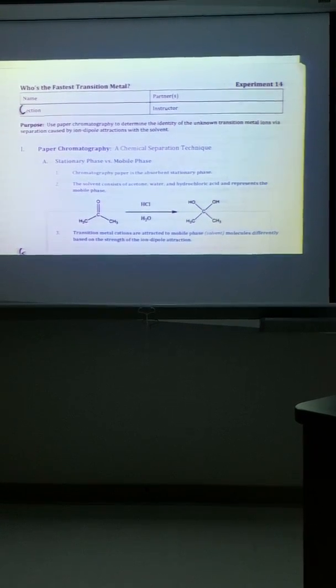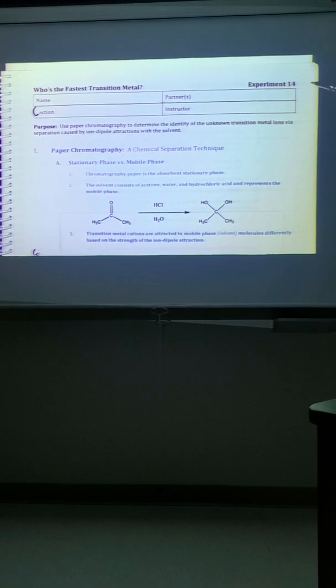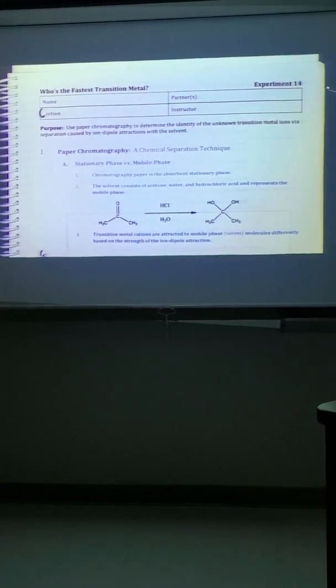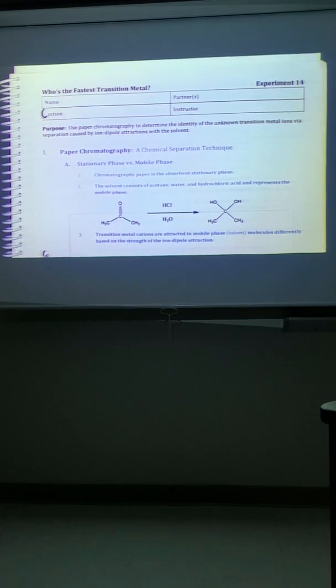Hey guys, this is Dr. Calkins again. Today we're at experiment 14, page 93. We're going to look at intermolecular forces with transition metals. So this is kind of a hybrid force where we have positive metal cations attracting our partially negative atoms.